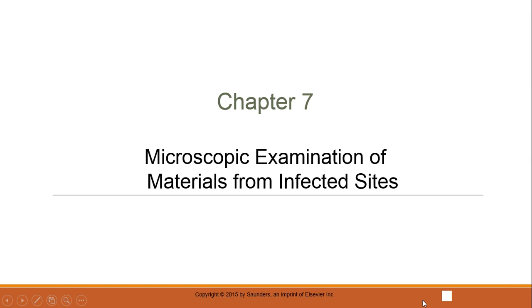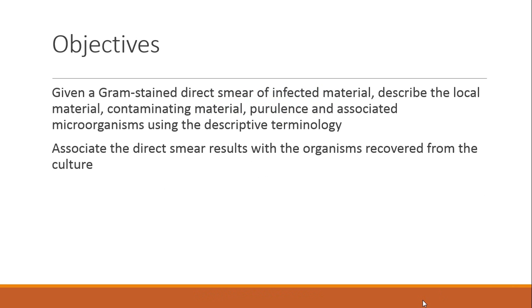All right, microscopic exam of infectious material, infected sites. All right, take a look at your objectives. There's not too many.